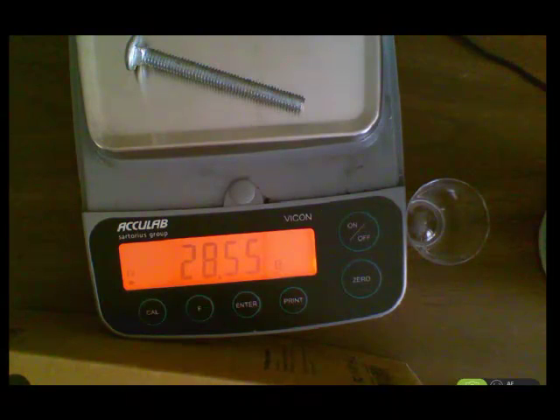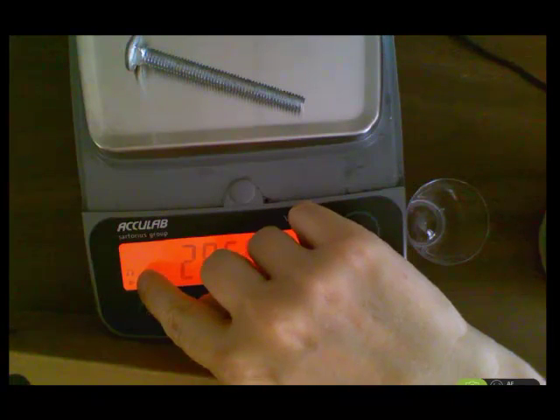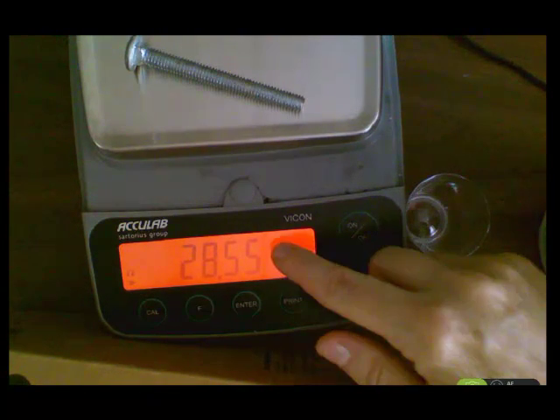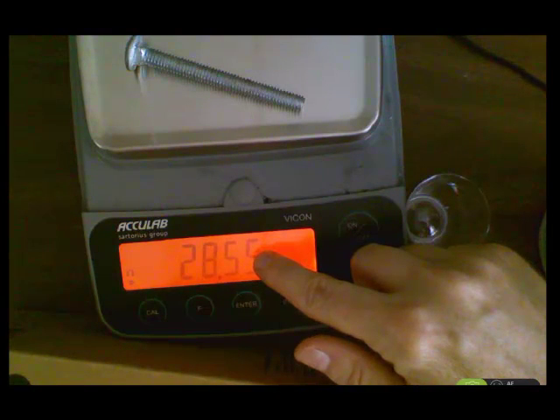And I wait. When you see this little symbol over here, the two little triangles connected with a line, that means that it's finished. So you would record 28.55 grams for the mass of the bolt. Sometimes you'll notice that the hundredths place will go up and down a little bit, and that's because the balance is estimating that last digit.